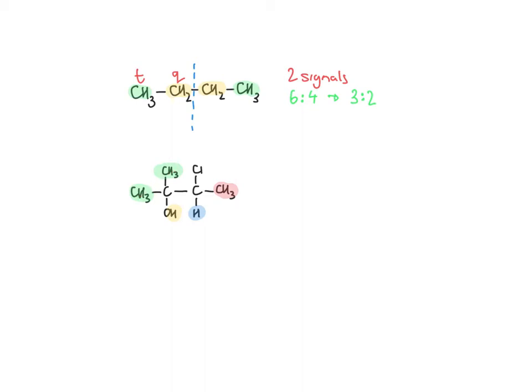Hopefully the other hydrogen environments are fairly obvious. If we're thinking then about the ratios, we've got 6 hydrogens, we've got 1 hydrogen, 3 hydrogens.